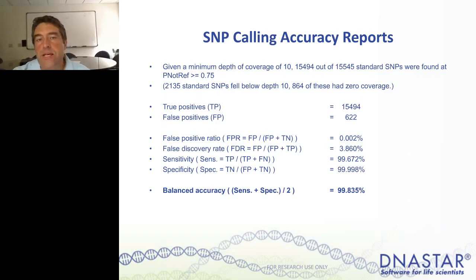You can see from our data set that we can calculate accuracy on the Genome in a Bottle data set across a large number of variations. And that's really what's key, is we can then go back and change some parameters for alignment and see, does this number go up or down? Not optimizing for one SNP in a data set, but really looking across 15,000 SNPs. Of course, these 15,000 SNPs are in an exome analysis.